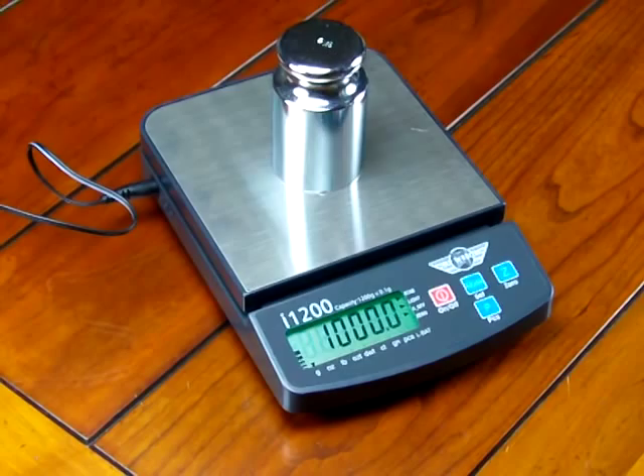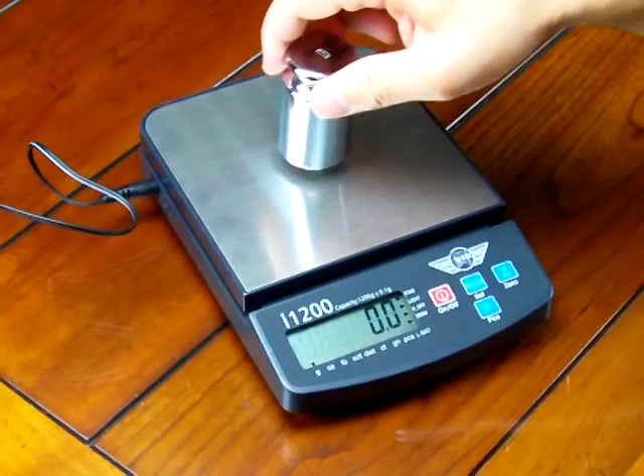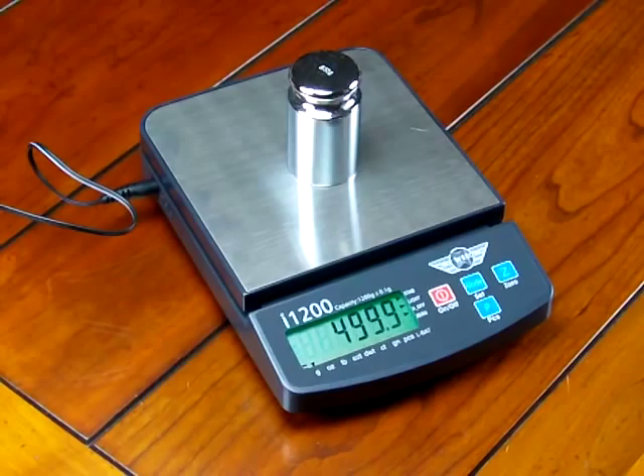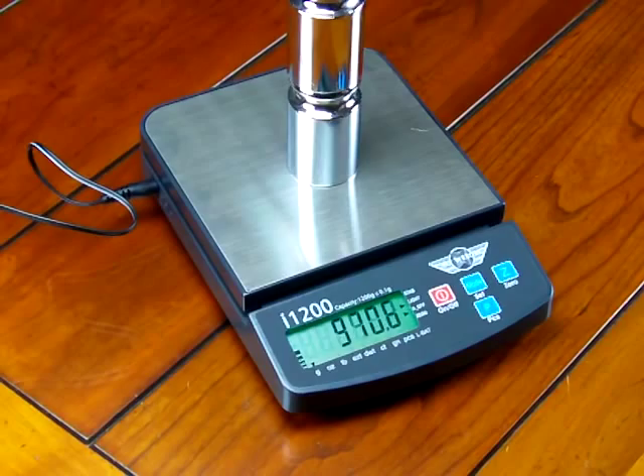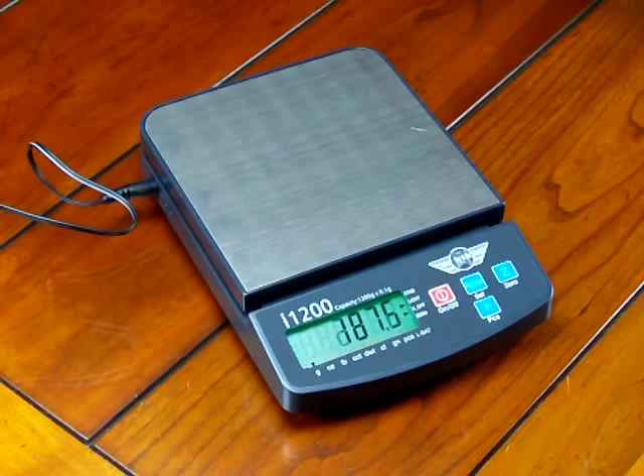So you can see when I took the scale out of the box, it read 1000.7 — off by 7 divisions. After calibration, here's my 500 gram weight: 500. Here's my other 500 gram weight: 1000. The scale is right on the money.